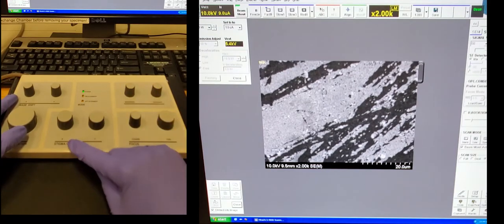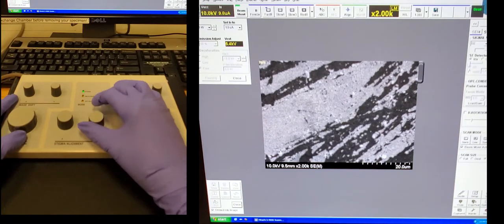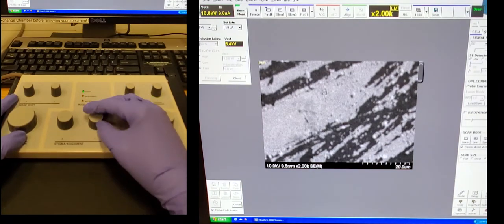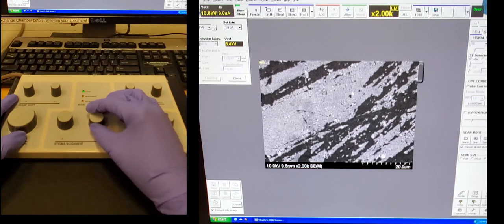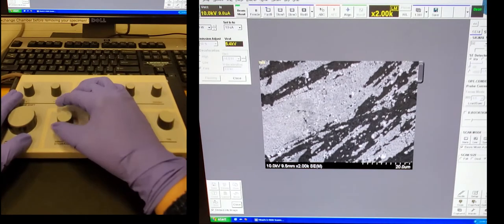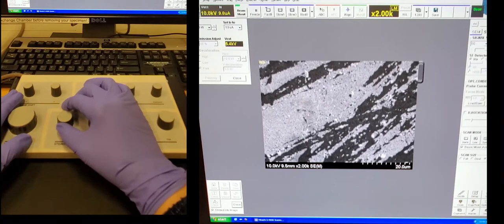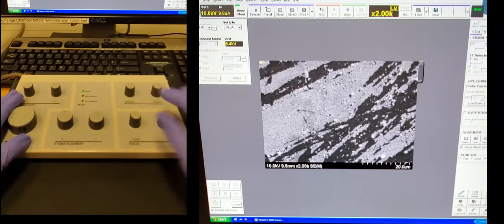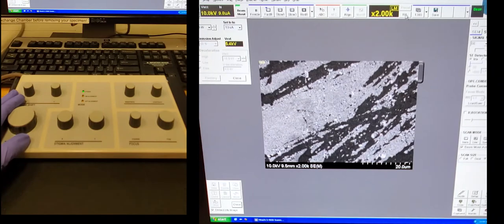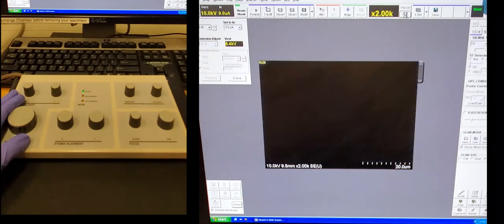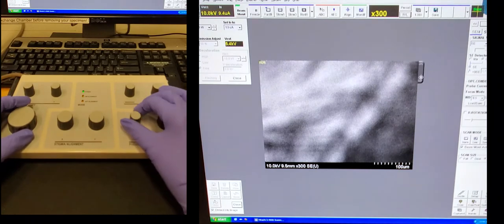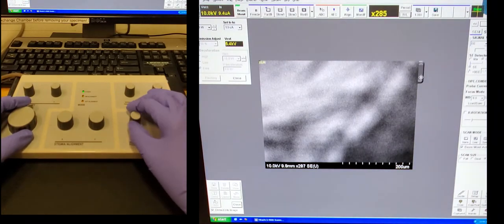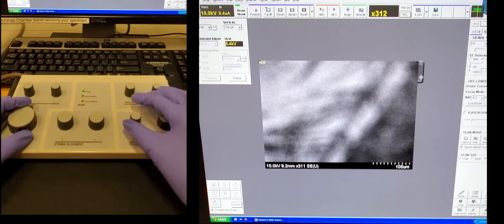You can see as you magnify, the focus may need adjusting as well. So we'll do that here. So these two knobs that I'm checking is the stigmatism. We'll check it in both the X and Y. Your focus may not be perfect if the stigmatism is off, so usually you can focus, check your stigmatism, and then recheck your focus again if needed. So click this button. We're going to switch to high mag. We do have to fix our focus again when we make this transition. That's okay.